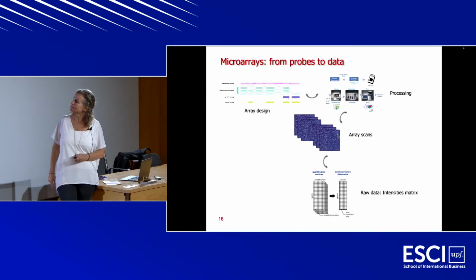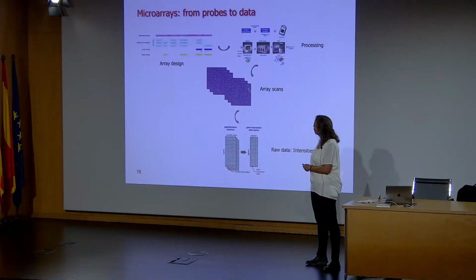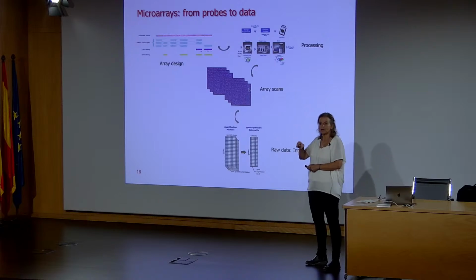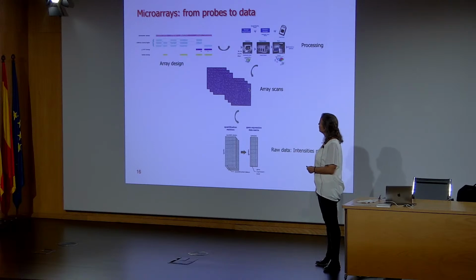So if we have a genomic locus, those are the different transcripts. Those are the different lines that you see here. Those are the probes that were pre-designed to interrogate these different transcripts. There are different technologies inside the microarray world that will allow us to focus on some exons or in some specific transcripts.